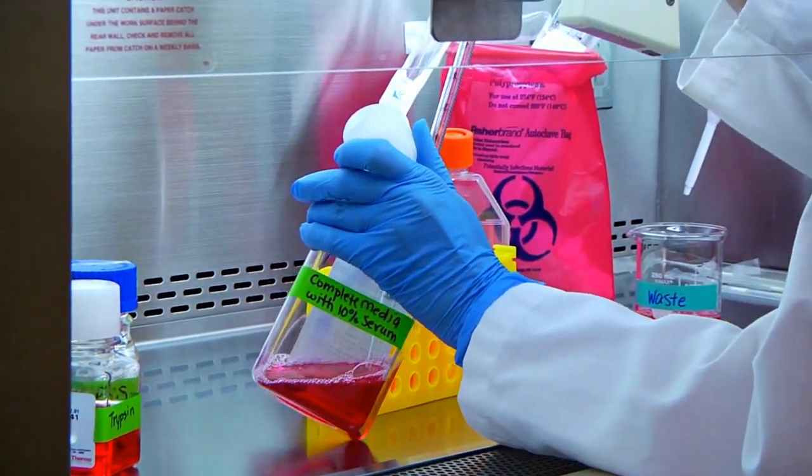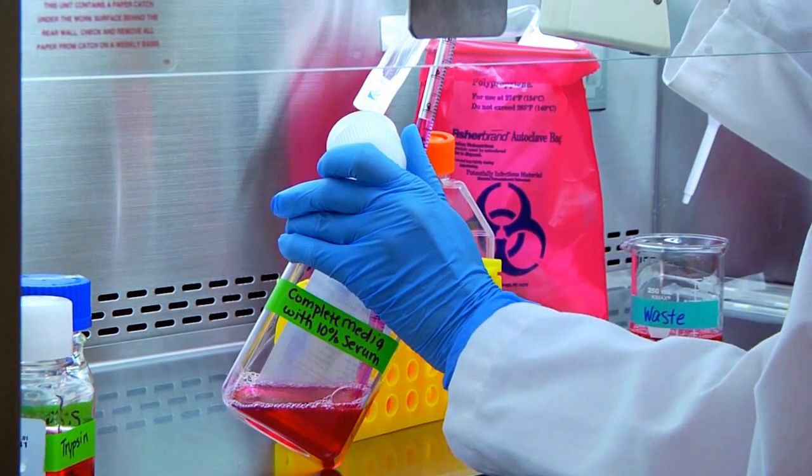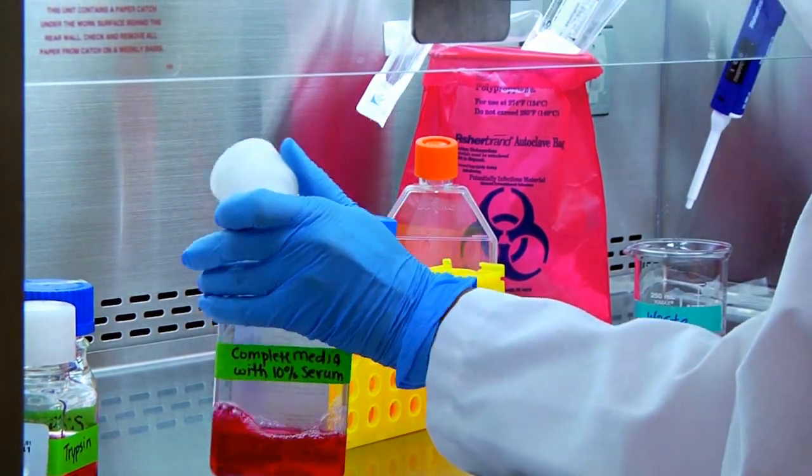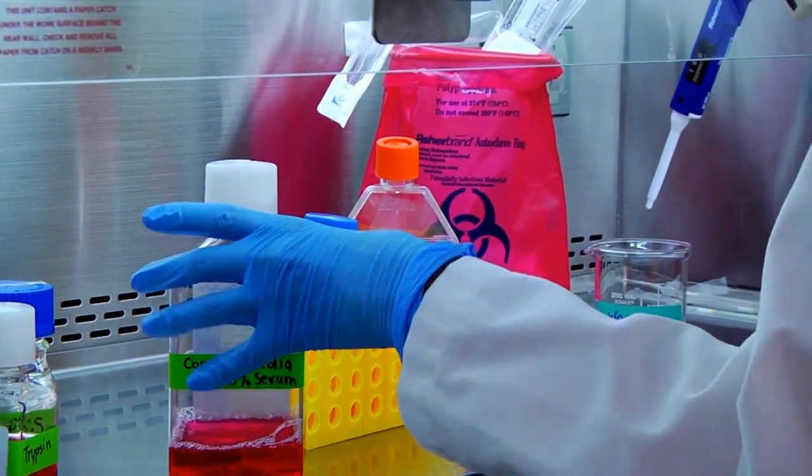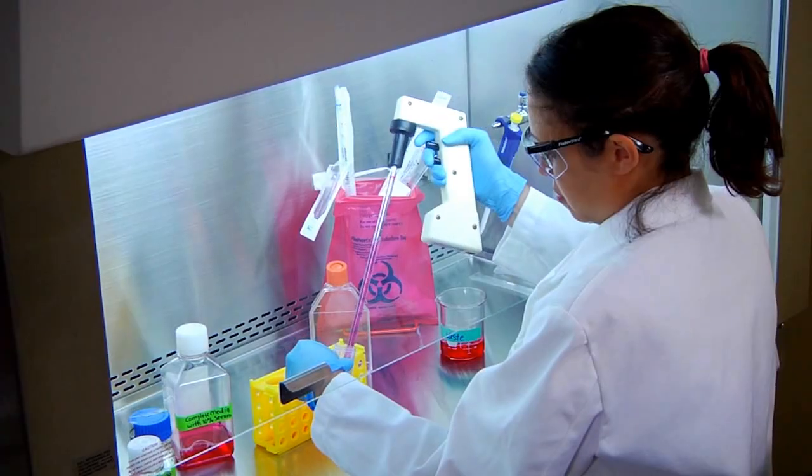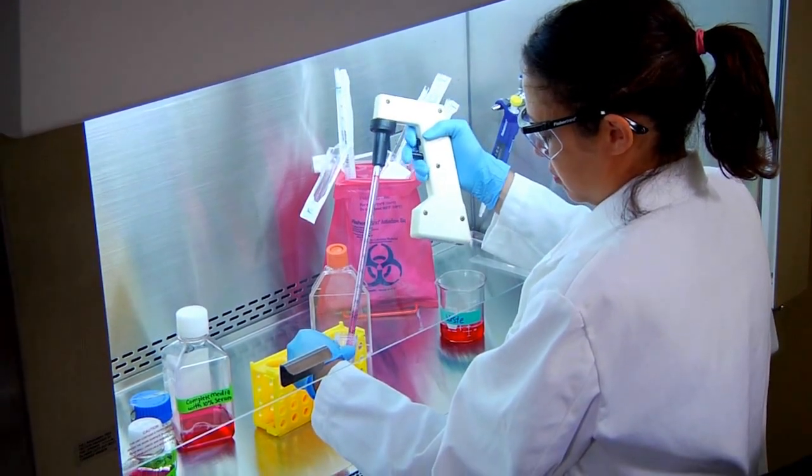Add 10 milliliters of fresh pre-warm culture medium to the tube. Re-suspend your cell pellet by pipetting up and down.